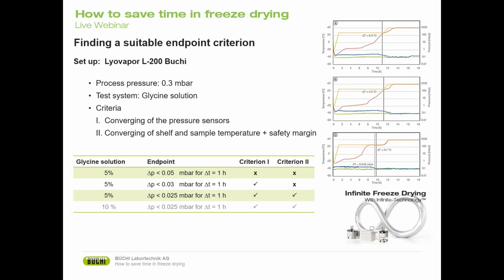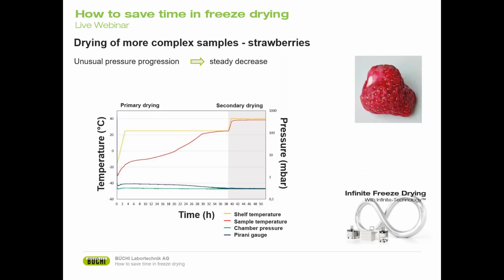So what I then wanted to do is test the limits and try a relatively complex system. And what we came up with were actually strawberries.